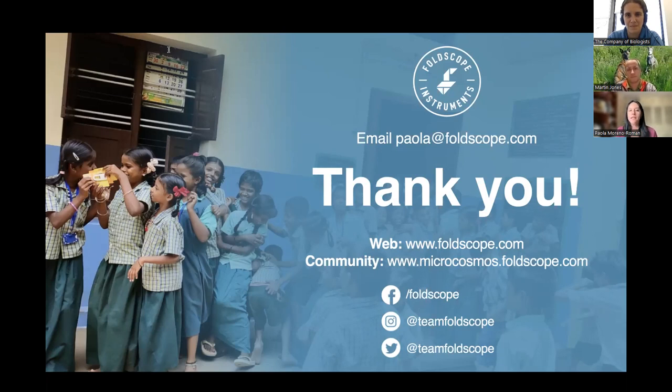It's absolutely fine if there's an adult with them. Four-year-olds can definitely do that, as I said. At that workshop, I paired a four-year-old with an older kid who was about 10 years old, and it went absolutely fine. But my recommendation would be 6 years and older, if they just want to play with the Foldscopes by themselves.